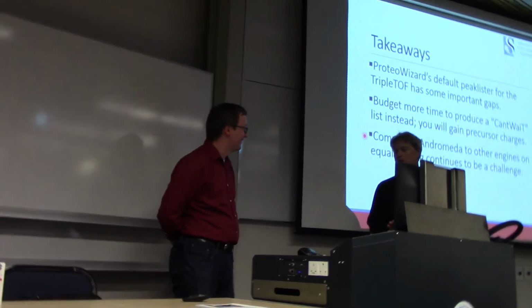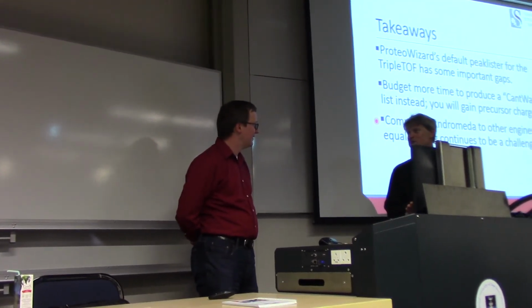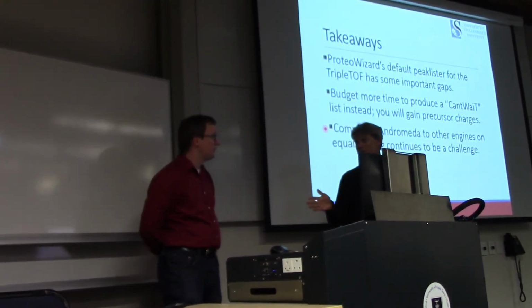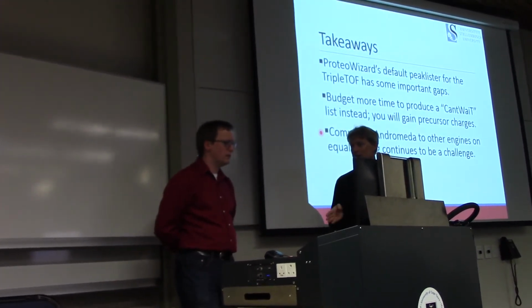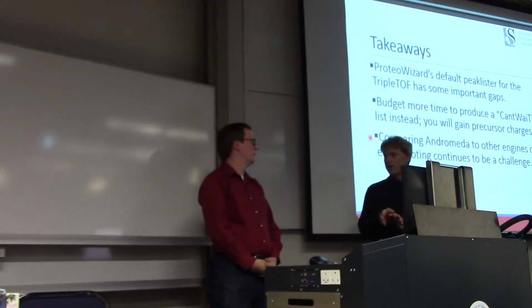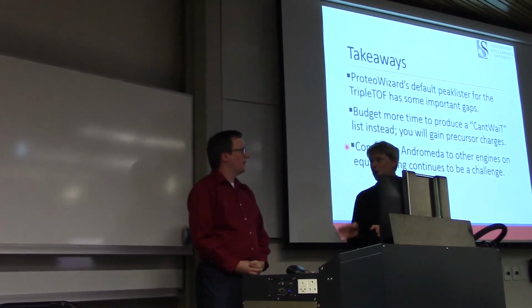So doesn't that argue that we need to use the TripleTOF in the first instance as a bloody good data-dependent acquisition instrument? They're pretty good. To acquire more spectra, or to rely on community effort to build the peptide library slowly, sure, and hope that eventually we will have a library from every possible conceivable peptide. Or is it a solution?